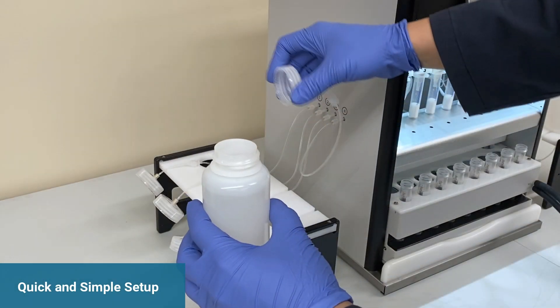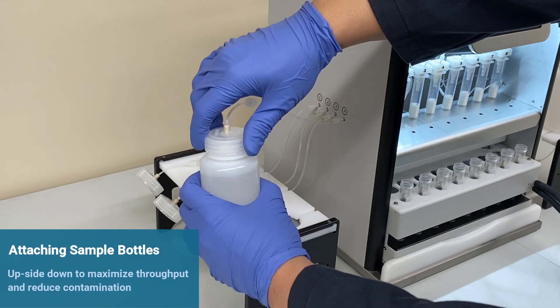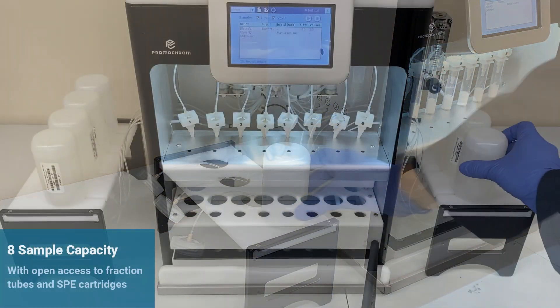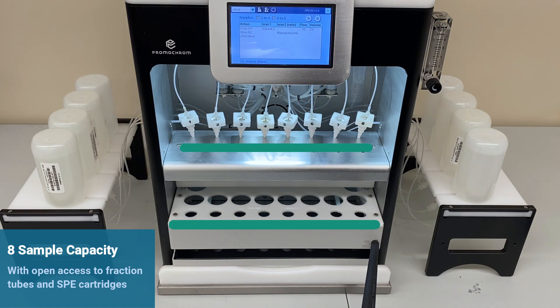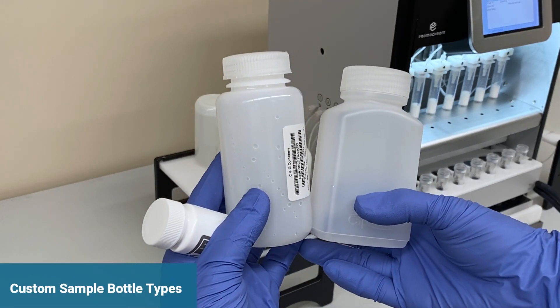Setting up for an extraction is quick and simple. Sample bottles can be easily mounted upside down using the adapters to maximize throughput and reduce contamination. Up to 8 samples can be loaded on the sides of the system, allowing open access to fractions and cartridges. Multiple types of sample bottles can be attached using custom adapters.